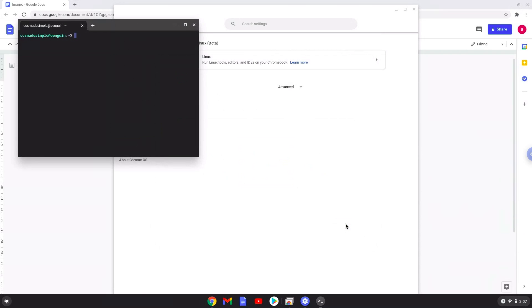Now that we have enabled Linux apps on our system, we will continue to the next step, which is to run several commands in a terminal which will install ImageJ. All the commands are in the video description.